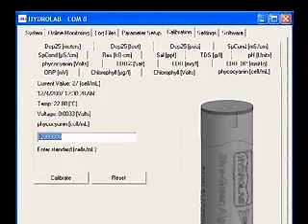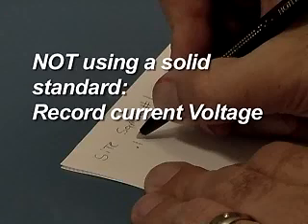Wait one minute for the readings to stabilize. Record the voltage reading.